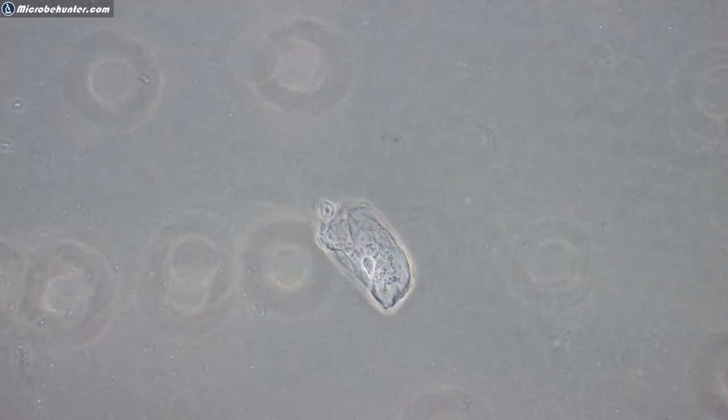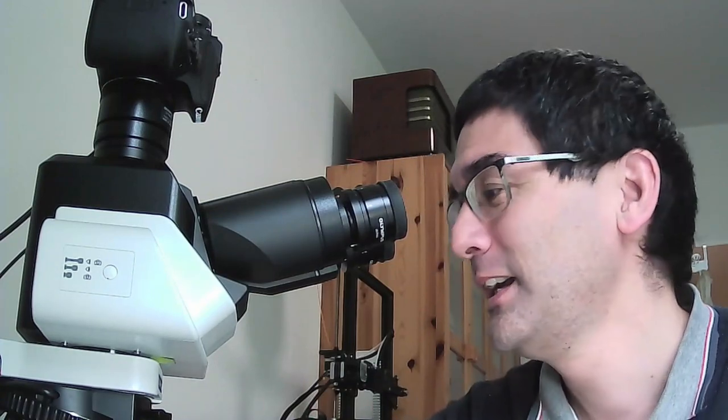I just want to say that different specimens are suitable for different microscopic techniques, of course. So, you cannot say that one technique is better than the other. There are some techniques that simply work better with some specimens than others. So yeah, each type of microscope configuration has its own world, so to say, okay?